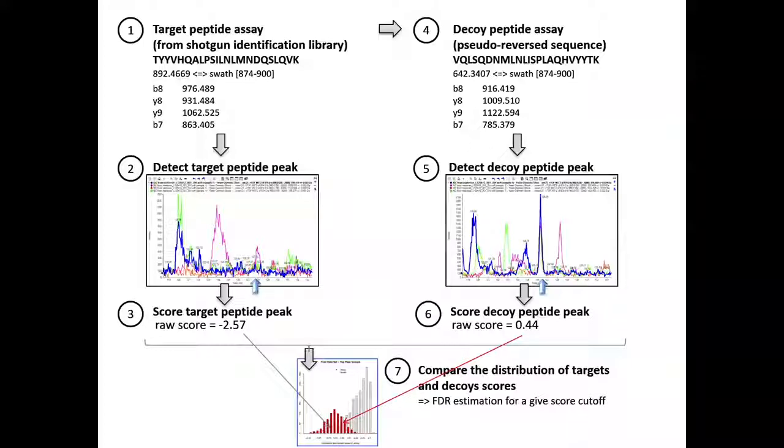The other thing is that it's often good to train your model and compute your p-values or q-values from different portions of your data set. Things like Percolator do that. It uses 10-fold cross-validation, calculates the SVM score 10 different times, and keeps checking on a different portion of the data set that the p-values are not overfitting. It's just something to keep in mind.